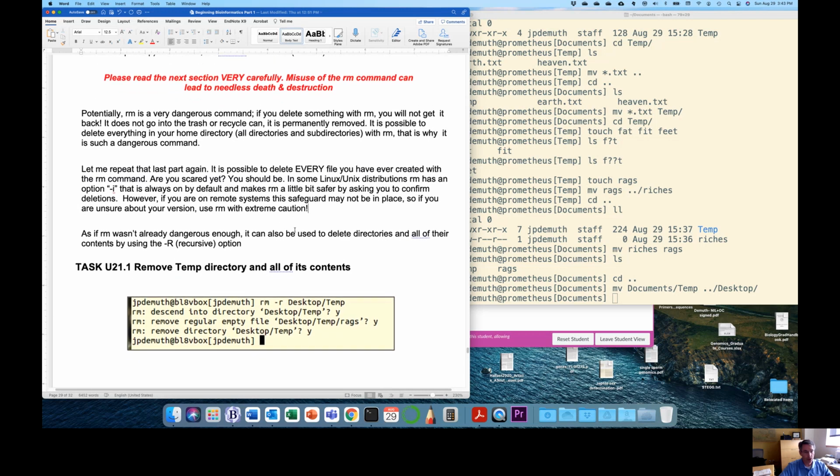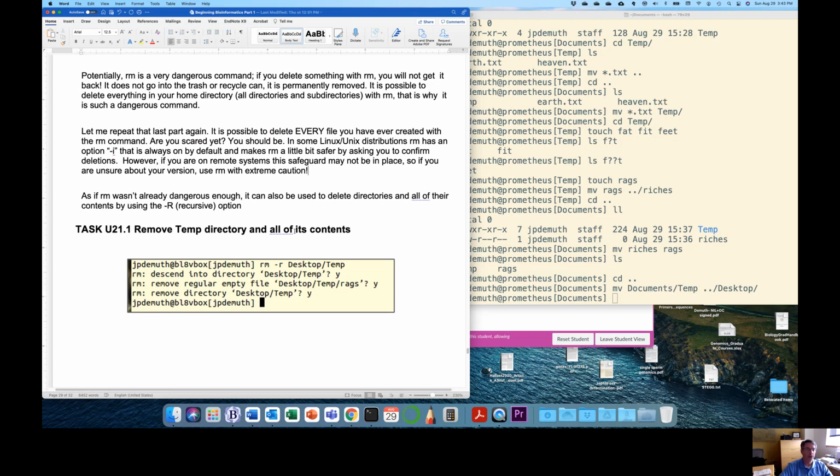If you follow the instructions in the tutorial, you shouldn't have any problems. And if you understand what you're removing, right? It is a very dangerous thing to use wildcards like that asterisk that I was talking about with the rm command. That's how the accident happened with the guy's system files.